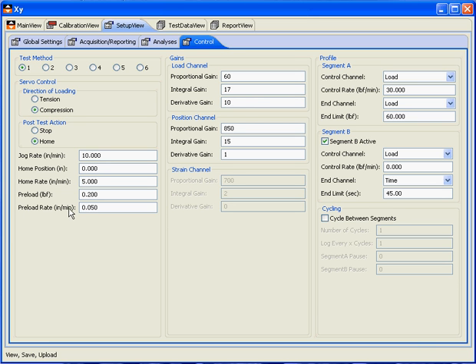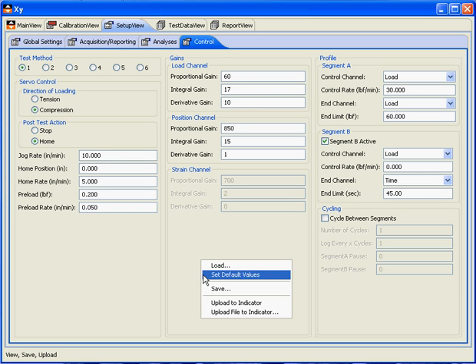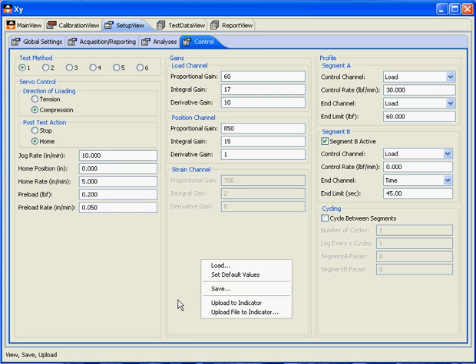Once we've completed our settings, we'll right-click, Upload to Indicator, and that will begin our test.